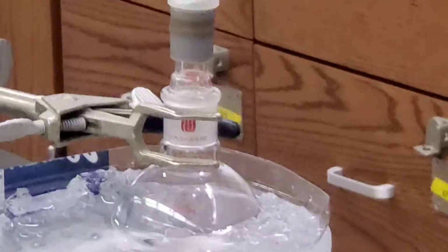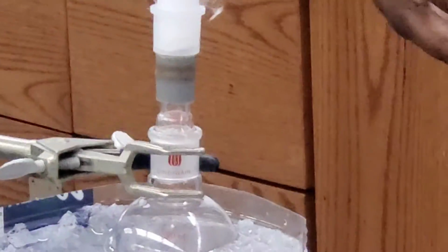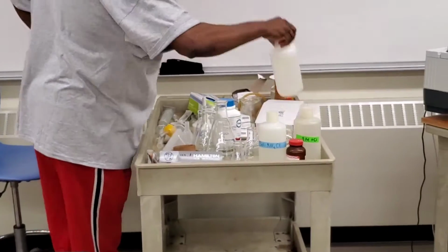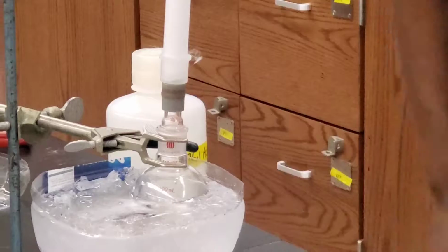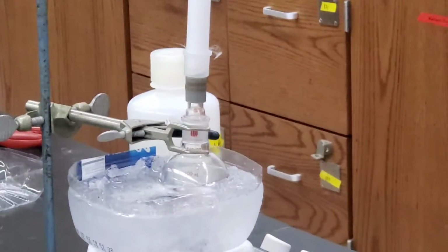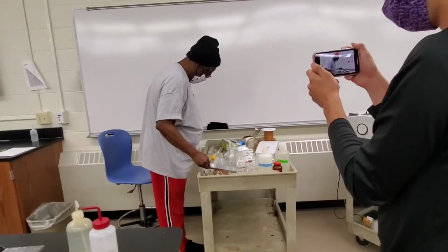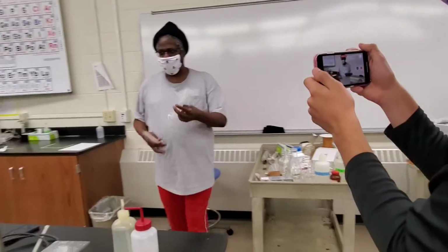could put that on there. And you could put it on immediately. Like we have the stir bar in there, and generally you add your solvent into this reaction. Let's say a solvent is ethyl acetate. For solvents, normally, unless it's specified, you could use a measuring cylinder, right?